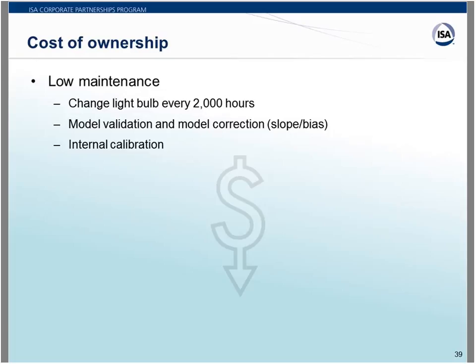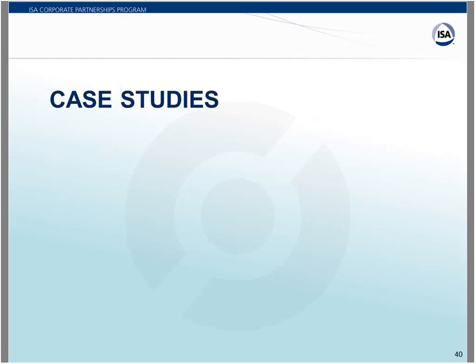The models built using the Chemometrics software have to be validated for different production processes, and they should be calibrated depending on the type of spectrometer used for real-time monitoring. And I guess it's time to end the science and engineering talk and move on to real-life case studies, which can serve as examples where the moisture content is measured from the component of interest during the production process.